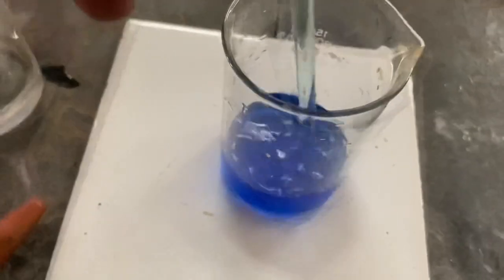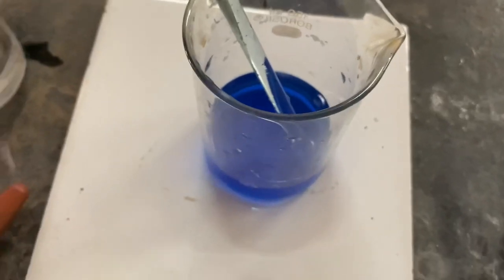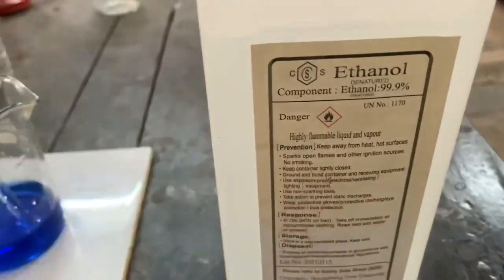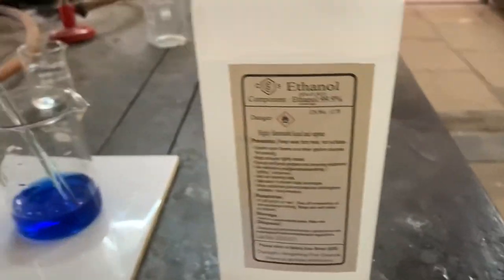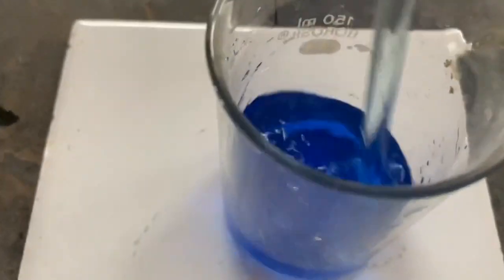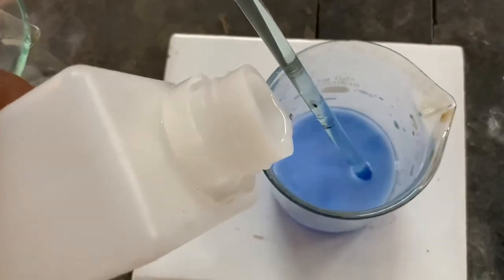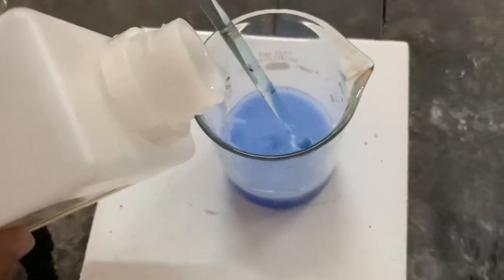Now this is the time to add alcohol to it. So this is ethyl alcohol. I will add this ethyl alcohol, about 40 ml of ethanol, to it with stirring. You can see the changes that take place with the addition of ethanol.